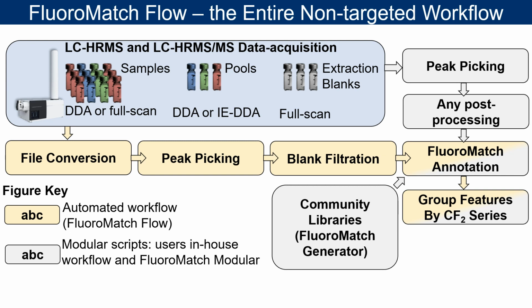Also, we have software available for users to develop their own PFAS libraries. So if you have fragmentation data from experiments or from standards for unique PFAS that you want to include in your screening, you can easily generate those libraries and include them in the software and hopefully provide them to the public.